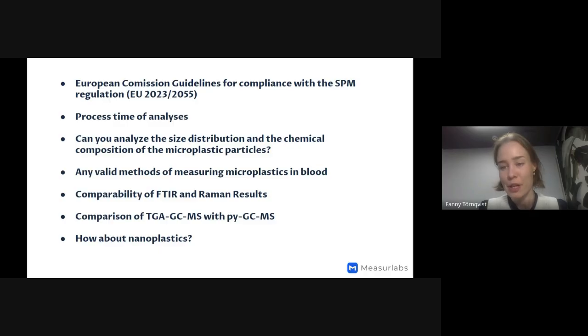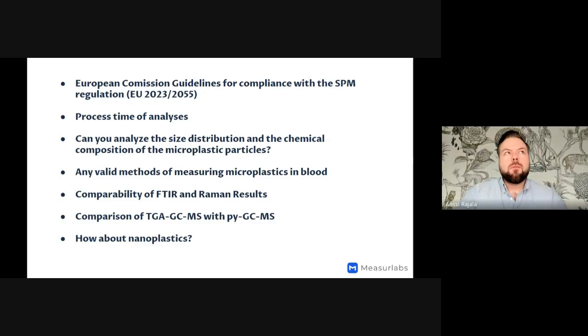Then we have a question about the uncertainty of the methods. Anssi, can you share what the estimated uncertainty of the methods is? Because these are not all very well standardized methods and very custom methods are often used, but in case of the more standardized and accredited methods we have available, the uncertainty is something like 20 to 25%. Okay.